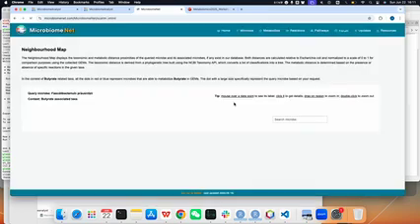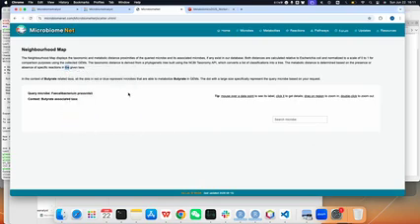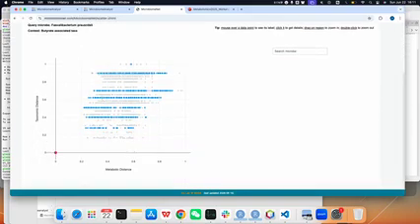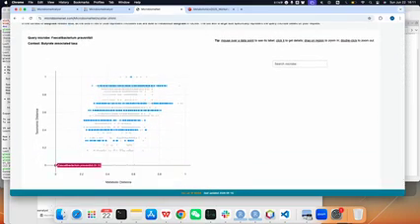So like this, yeah. This is a web issue, I guess, because it is quite slow here. So here, this is the input species, and then we can search the others.